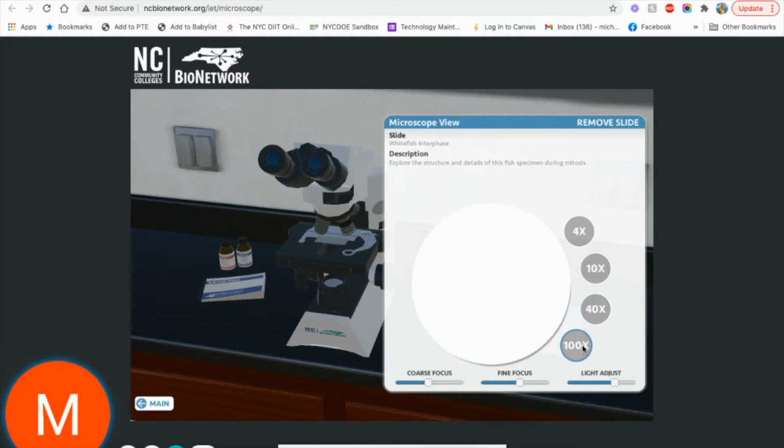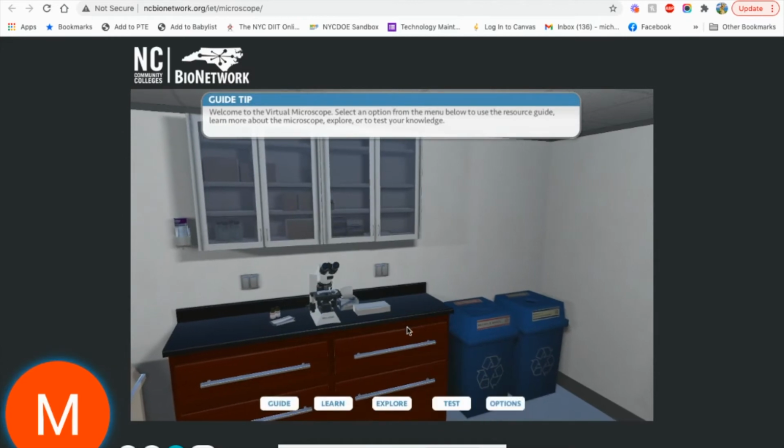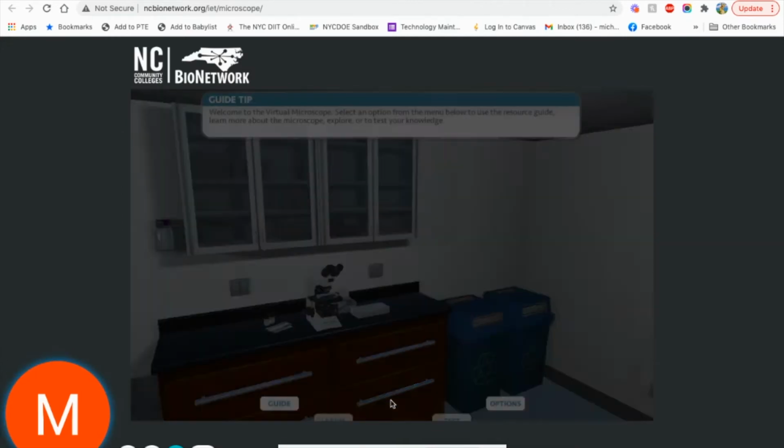You'll notice if you go to do the 100, it'll ask you to use the oil immersion. So we're going to skip that one. And again, if you use the oil immersion, you're going to have to kind of back out and go back in.